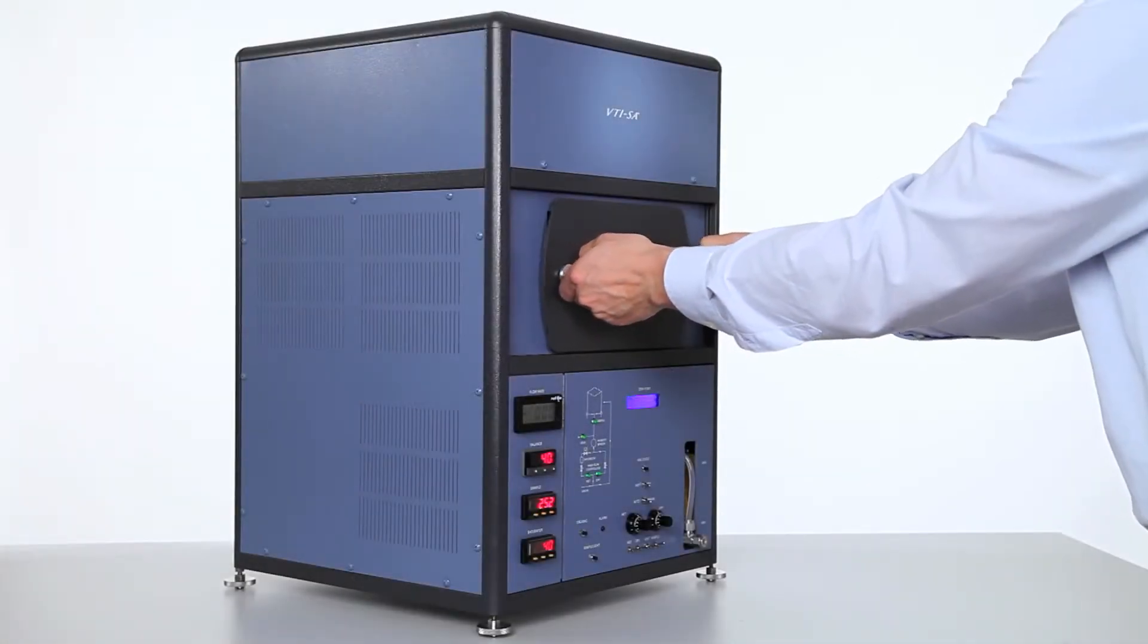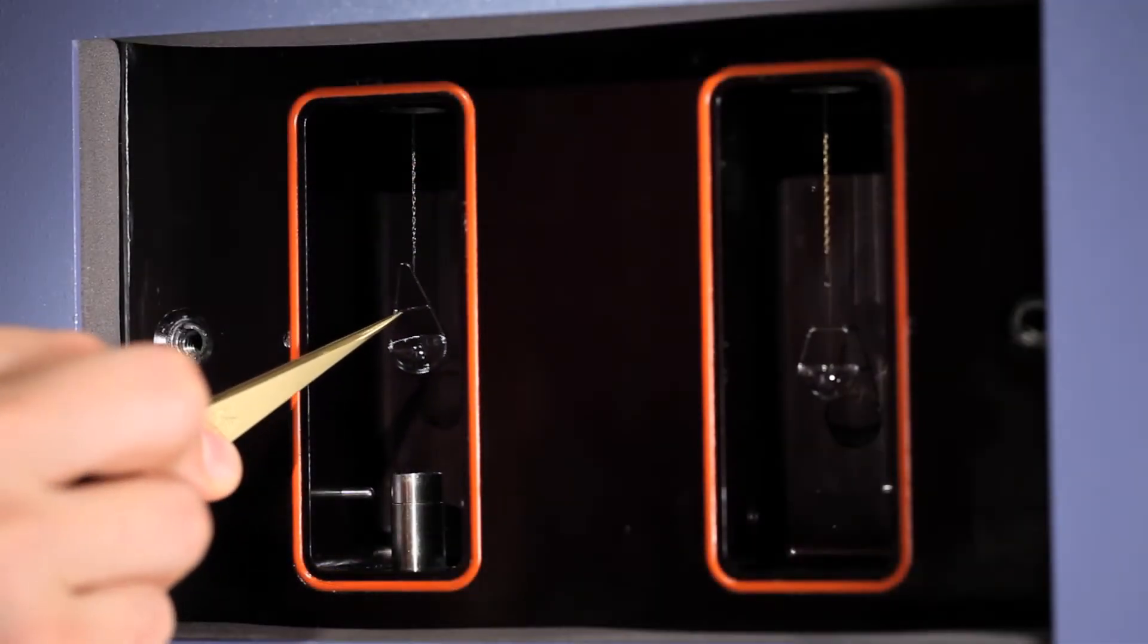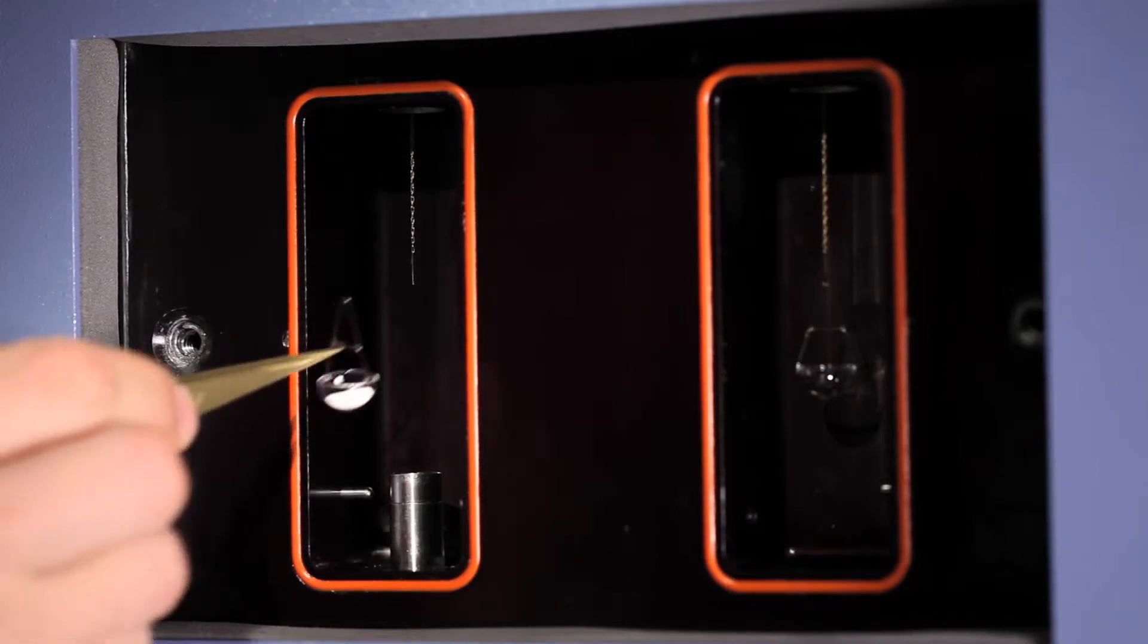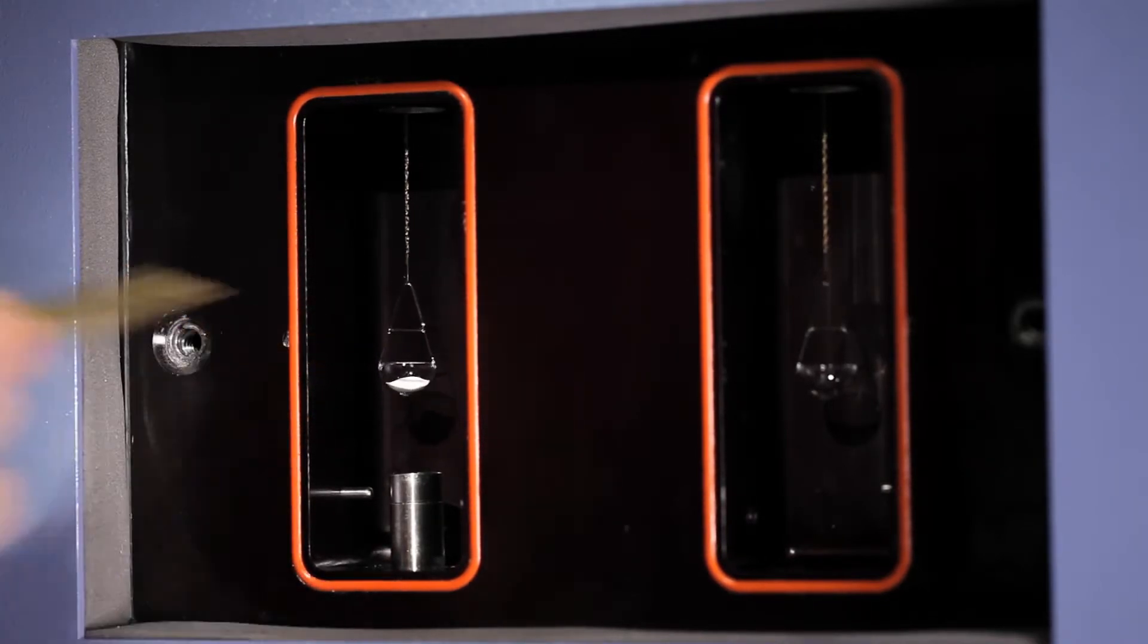Open chamber door and carefully remove a sample, placing it on a clean surface. Fill the pan with the sample. Hang the sample pan from the hangdown chain. Choose the same type of pan for the reference side.